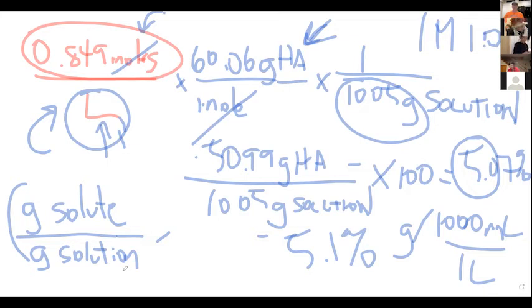Okay. Don't round numbers before you have to. In fact, when I'm doing my calculation, I don't round at all until I get to the very end. So if I divide 3 digits by 3 digits on my calculator and I get 8 digits, I just leave them there until the very end, and then I round everything. Because if you start rounding things, you're losing precision in your results. So you don't want to do that.